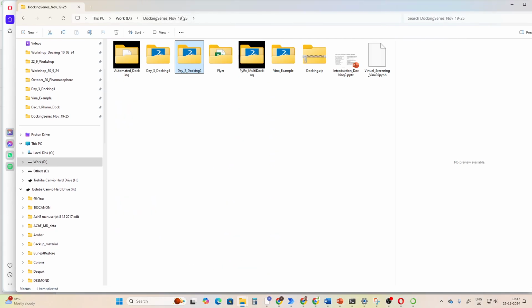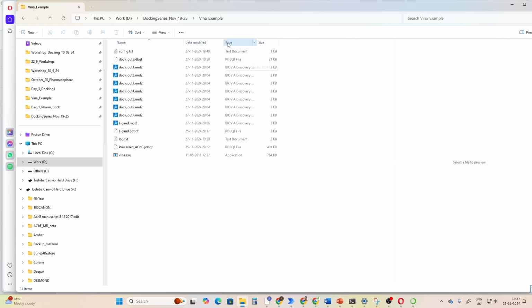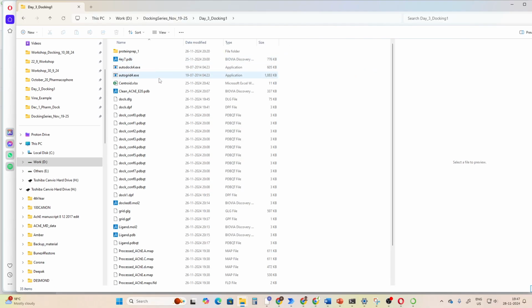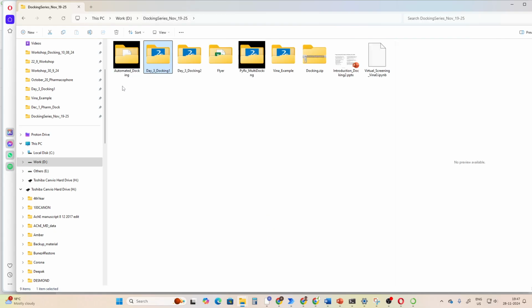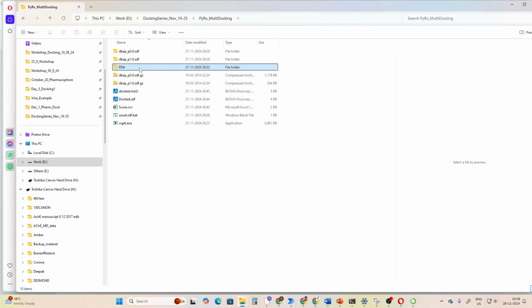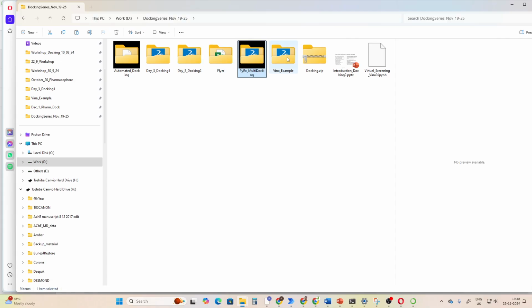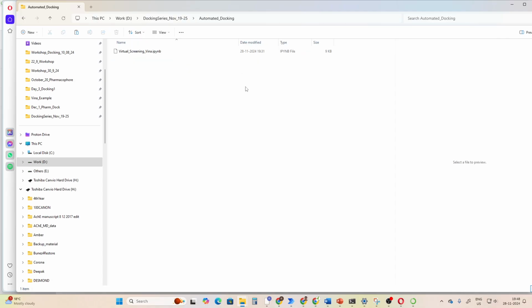Okay, let's see. Okay, let's take this one. Okay, FDA molecule. And paste it here, right?